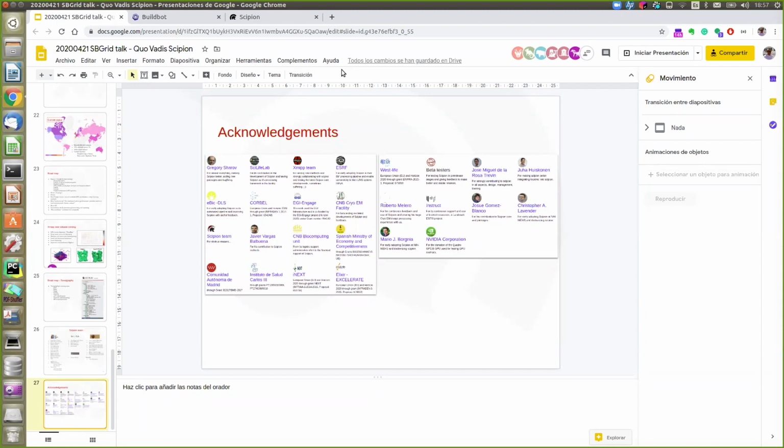If you go back to Scipion 2, the project will still be able to load, but Scipion 2.0 doesn't know anything about tomography stuff. So you will be able to open your project and work with it, but some boxes will be drawn in the graph, and when you click on them, you will not be able to see anything because they are considered legacy or something unknown. But we are making efforts to keep compatibility, and so far I think it's compatible. I can switch back and forth from Scipion 2 to Scipion 3. Yes. Great.